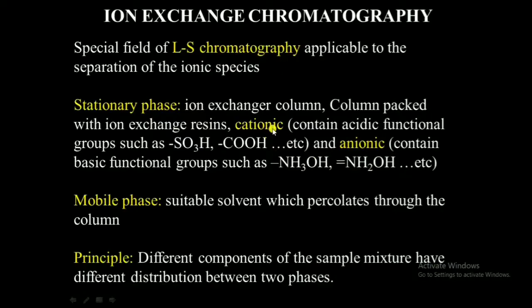The cationic ion exchange resin contains acidic functional groups such as SO3H, COOH, etc. So here the acidic hydrogen is exchanging with the ions present in our mixture. So H+ is exchanging for the cations present in our mixture.